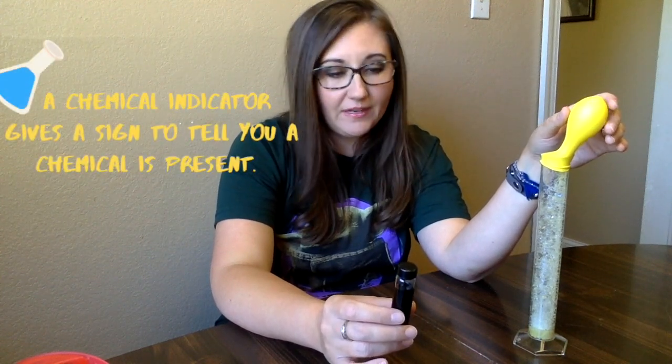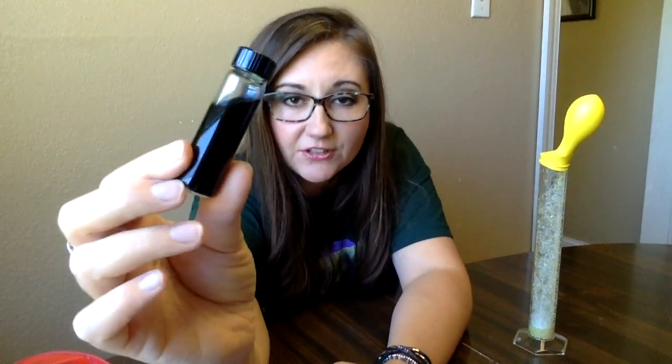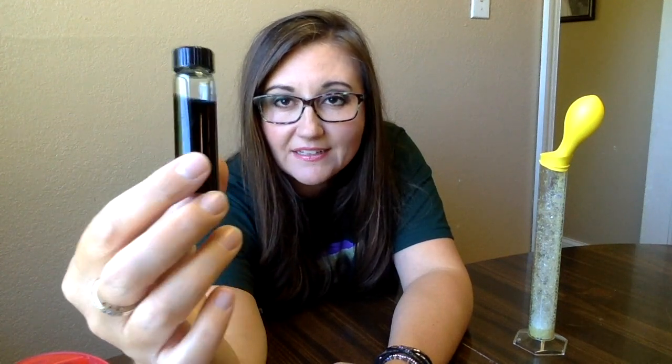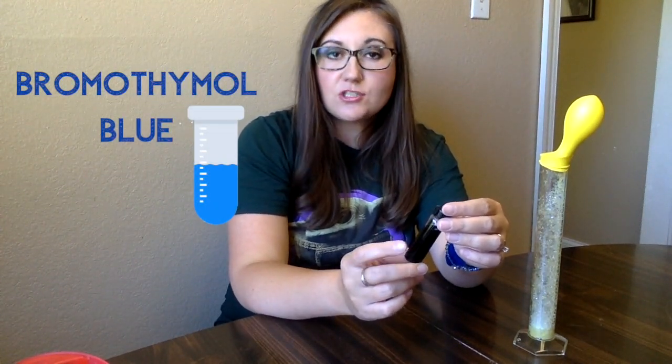One other thing that I want to show you today with this is I'm going to prove to you that that is actually carbon dioxide. And I'm going to use something called a chemical indicator, okay? More specifically, a pH indicator, which is going to tell if something is an acid or a base. So, in this little tube here, I've got this little liquid. It's blue, as you can see, really, really dark blue, almost black. This is called bromothymol blue. It's a chemical indicator which is going to change colors when it's exposed to an acid.